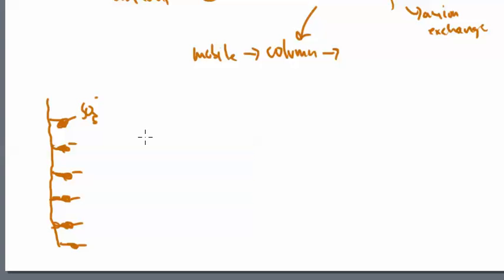And these SO3 groups will just kind of hang out, and these positive cations that begin to come through the actual column itself, positive, positive, positive, positive, they begin to get attracted to these negative SO3 groups, and they kind of hang out for a while. They go on a date, they have a good time, and then there comes a point where they have to break up, and they say, I'm sorry, this is not going to work out. The mobile phase keeps interfering, so the mobile phase is going to push me along, and I'm going to gradually travel through the column and then out the other end.